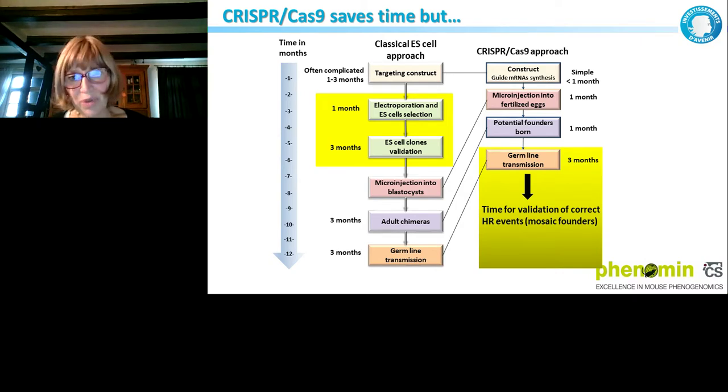Whereas when you use CRISPR, you can go fast, you will obtain very quickly a founder, even germline, but after, remember my little elephants, you still need to really validate that everything is perfectly fine. I think it's really important to keep in mind that even if CRISPR looks really simple, everybody wants it to be really simple. It is simple, it is great, wonderful, but you really need to validate carefully the lines that you are generating in order to make sure that you are not following something that is an artifact.